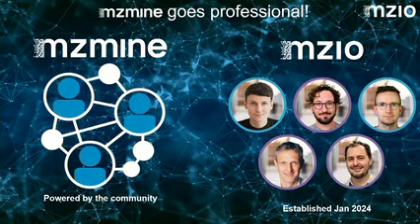MZmine is going to be not only a community project that's developed by academic labs, which it remains, but it's also going to be a professional project that's developed by a commercial company and being offered with all the requirements of these professional customers, such as support and documentation and so on, to the pharma and biotech industry. So this is our team, and you will see some of the people speaking here.